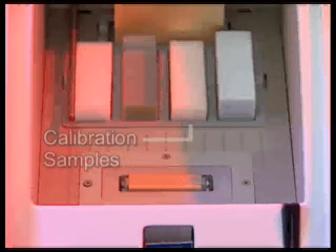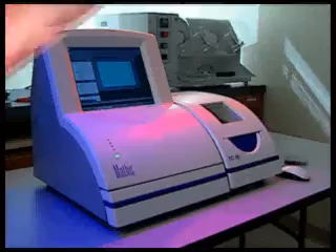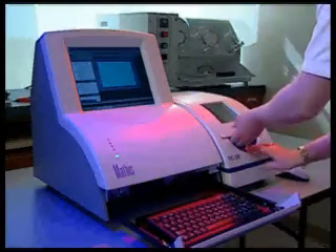The chamber also contains the calibration samples, ensuring that they are maintained at a stable 30 degrees Celsius. The Mathis TC30 is very simple to operate. Calibration is completely automated and the testing procedure is just as easy.